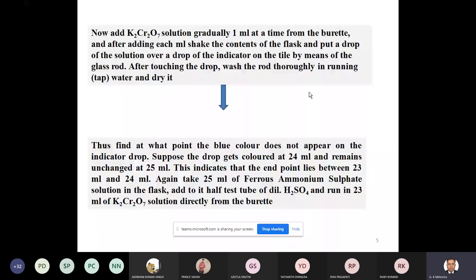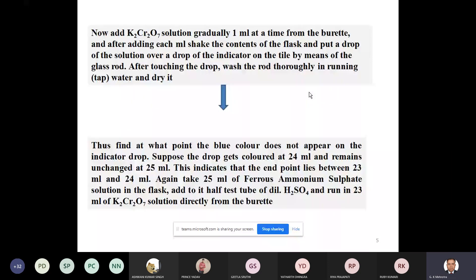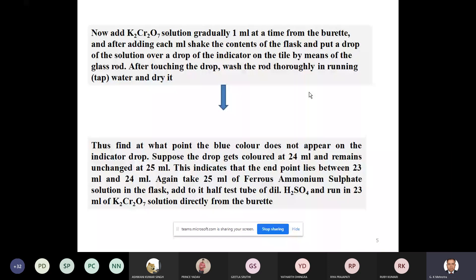Let me explain how to use this external indicator. You pipette out 25 cc of ferrous ammonium sulfate into the titration flask, then add roughly one test tube full of dilute H2SO4 to make the medium acidic. Then you start adding dichromate from the burette — known or unknown. Suppose you are doing the known one first. Fill the burette from 0 to 50, rinse it cleanly, and finally rinse with the dichromate solution you are going to use.